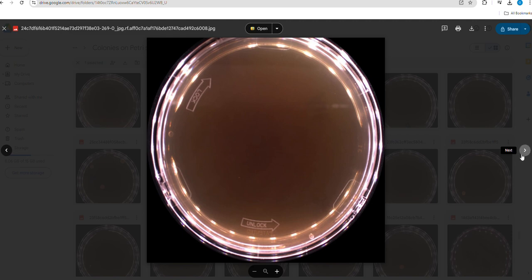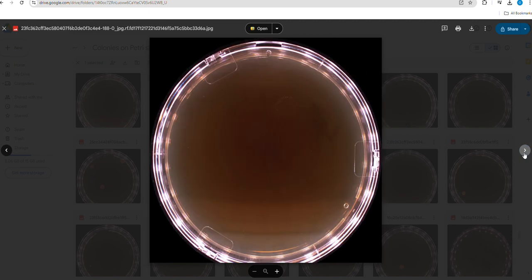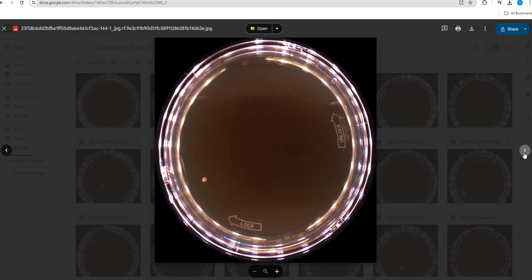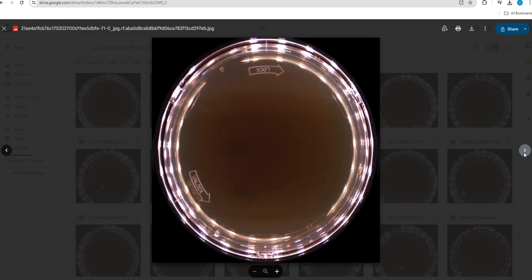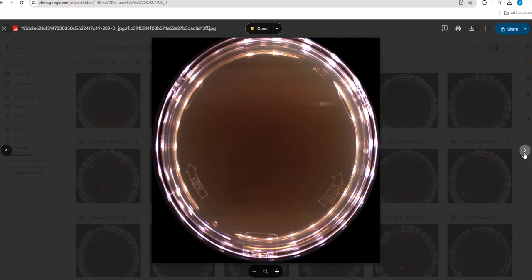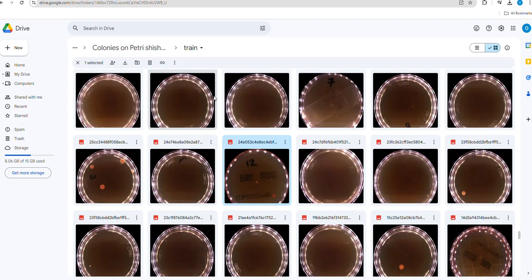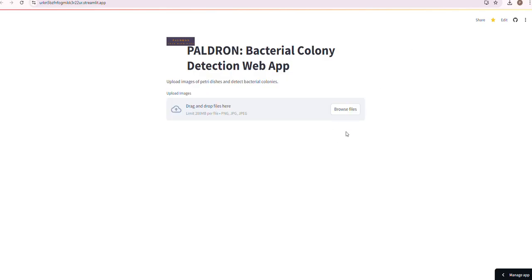And it's possible that we're looking at the other side of the plate, which is why they don't appear on all the sides of the plate. But you can see very clearly here that each one of these plates has small features that could potentially throw off any type of imaging that occurs. And they're all approximately the same because again, this is just my training set. So taking this training set, I've trained a model and we'll see what the results look like.